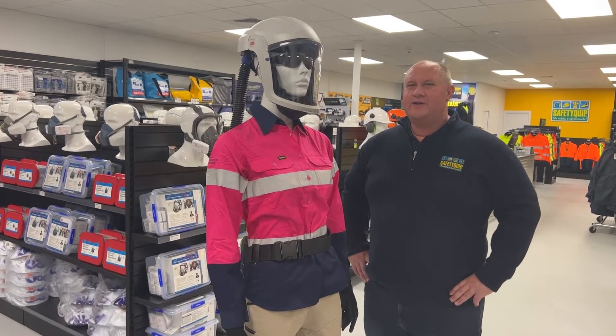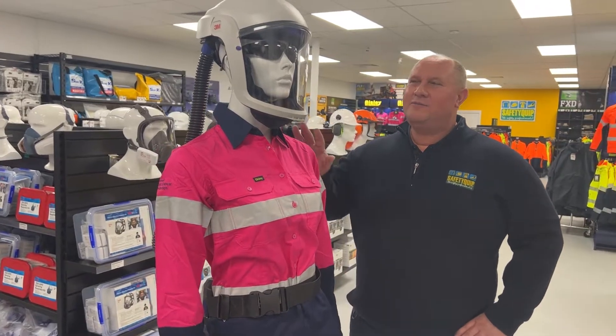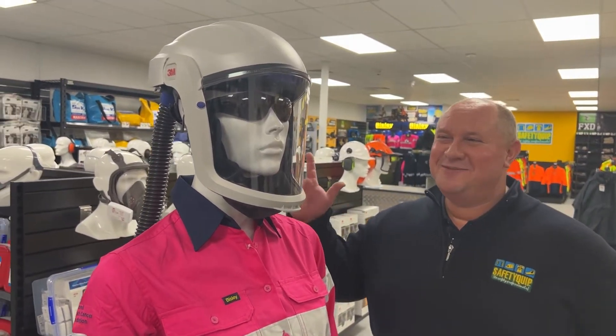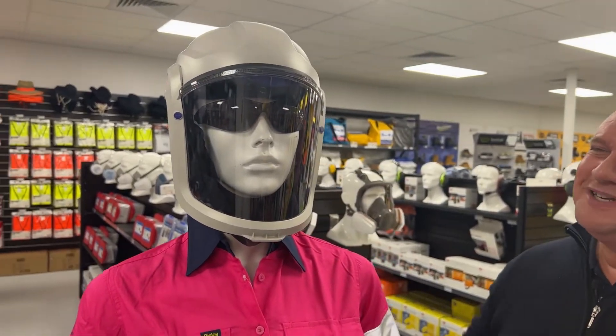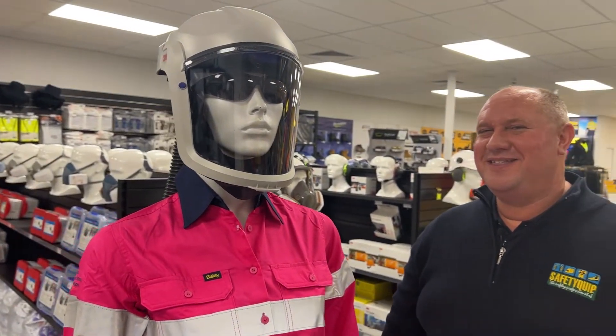At SafetyQuip, we've noticed an increase in demand for respirators for people with beards. Now my mate here doesn't currently have a beard, but who knows, maybe she would like to grow facial hair in the future — who am I to judge? What she's wearing is potentially a suitable solution for somebody with a beard.